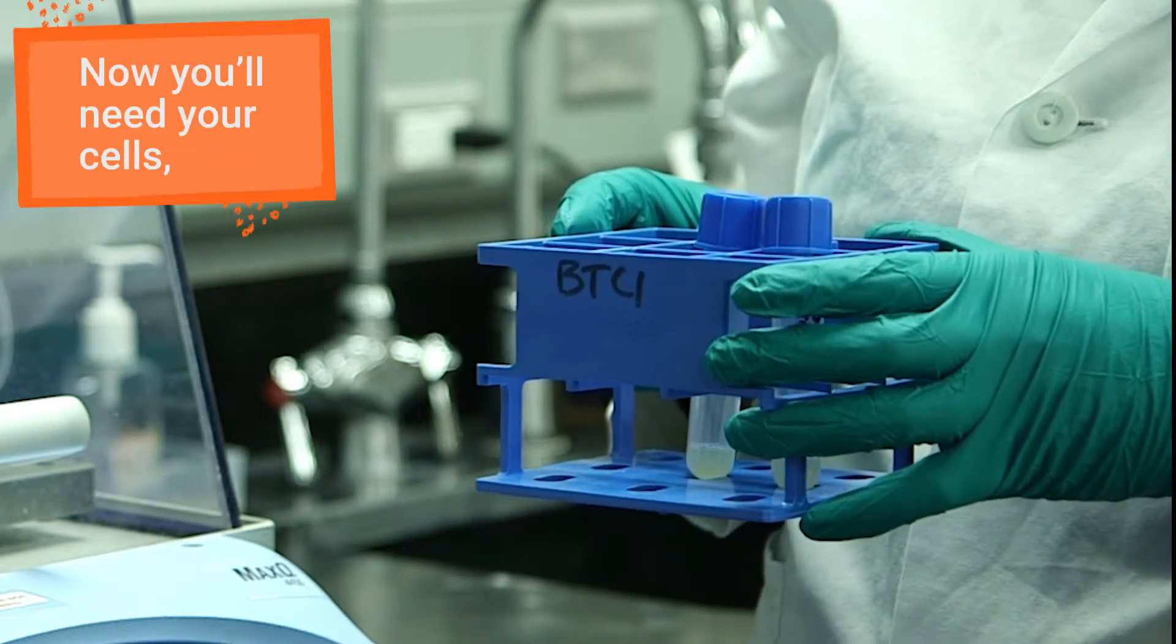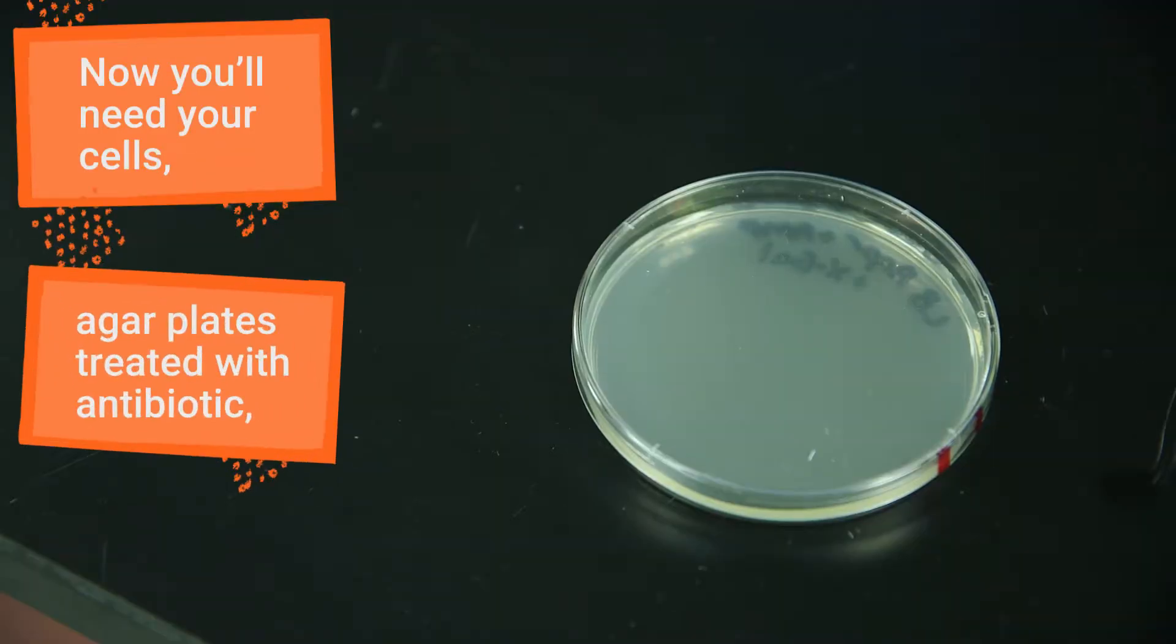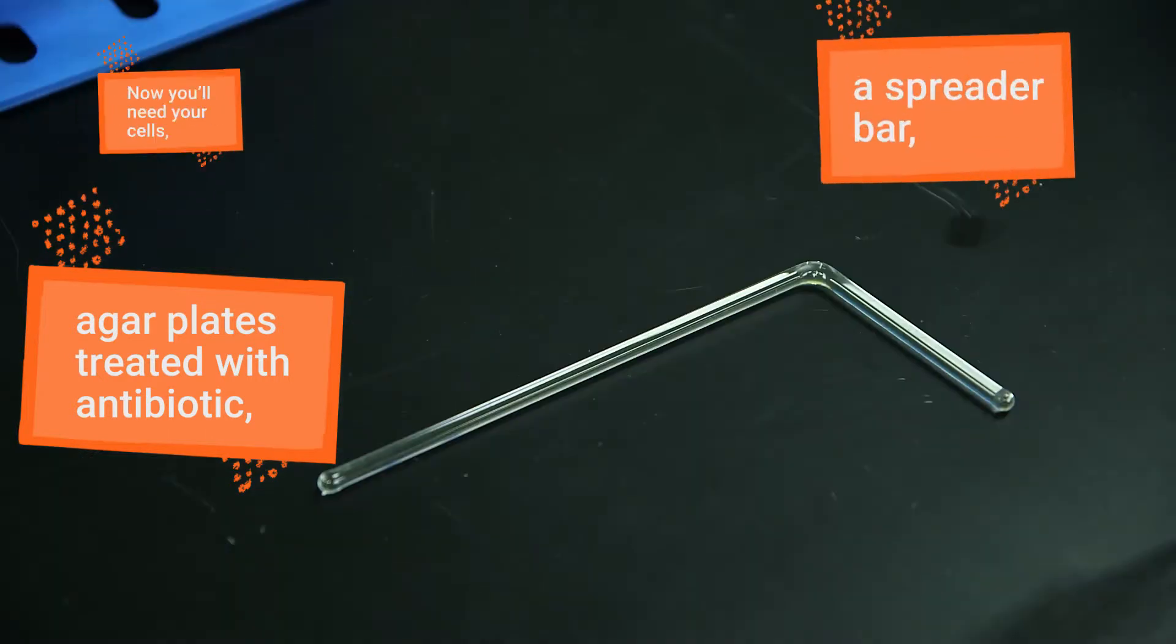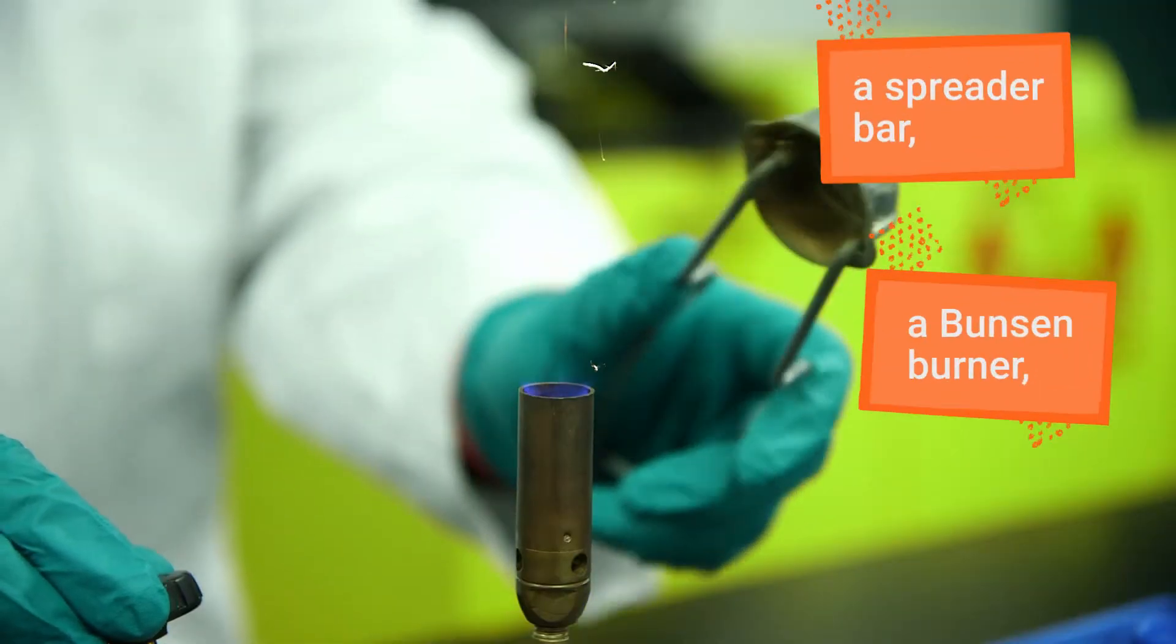For this step, you'll need your cells, agar plates treated with the appropriate antibiotic, a spreader bar, a Bunsen burner, and ethanol.